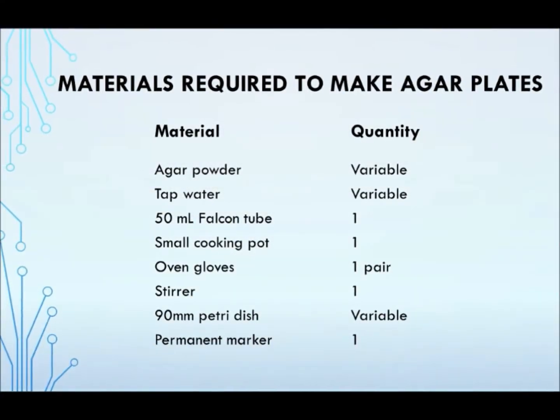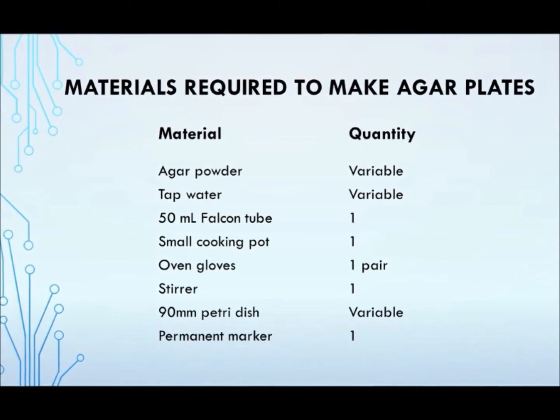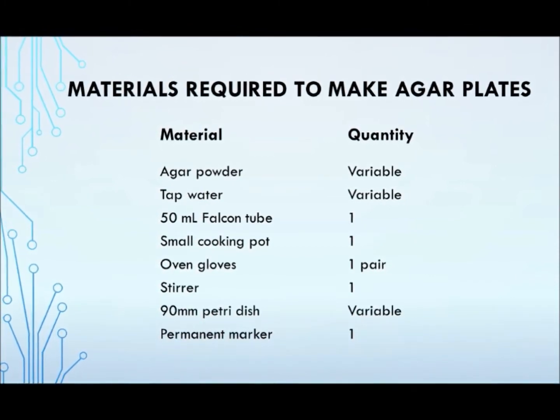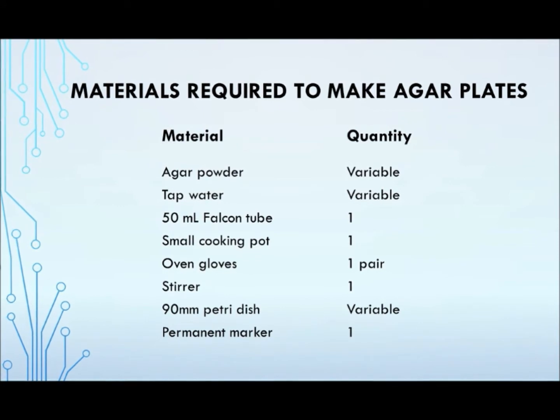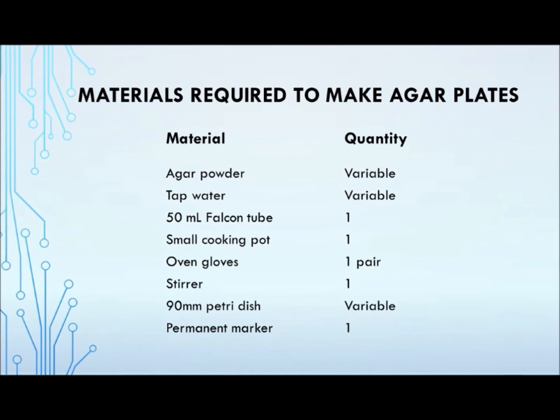This video will show you how to prepare the agar plates for you to grow the slime mold. Note that the amount of agar powder and tap water can vary, depending on the concentration of agar that you wish to prepare.